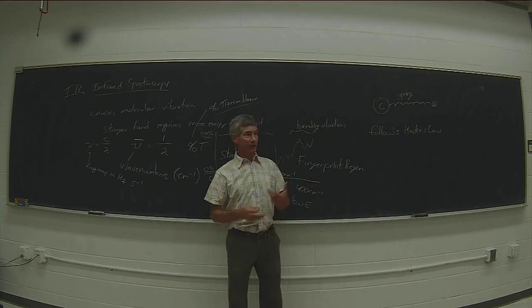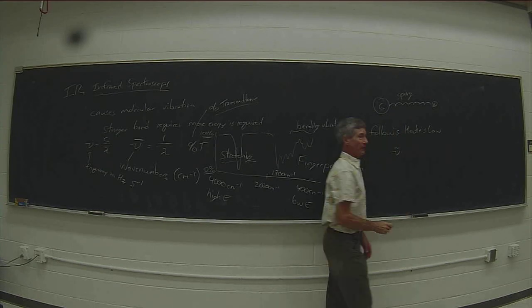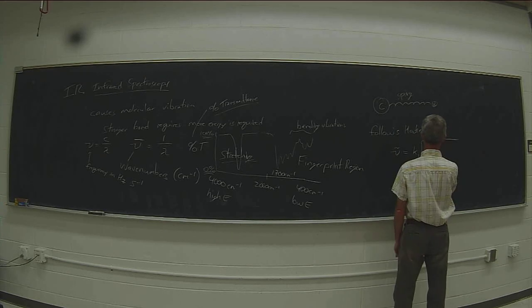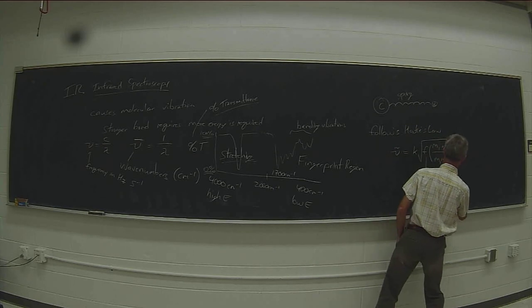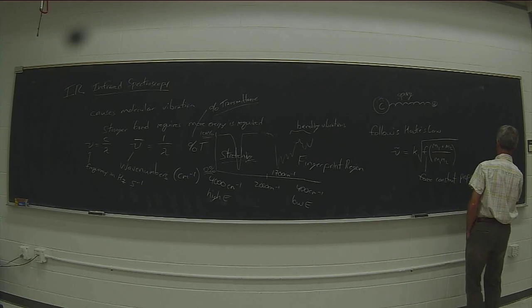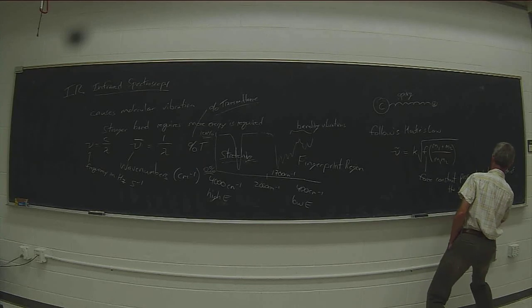And the energy, or in this case, the wave numbers, right, which is 1 over centimeters, follows Hooke's law, which says that the number of wave numbers is equal to some constant times the square root of a force constant, which is proportional to the strength of the spring, or in our case, the bond.